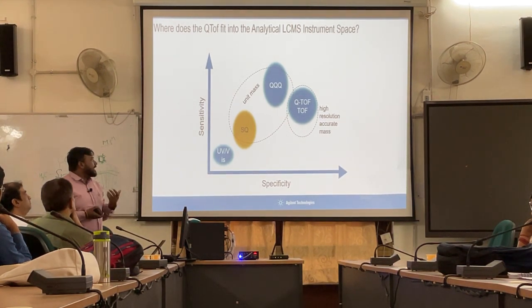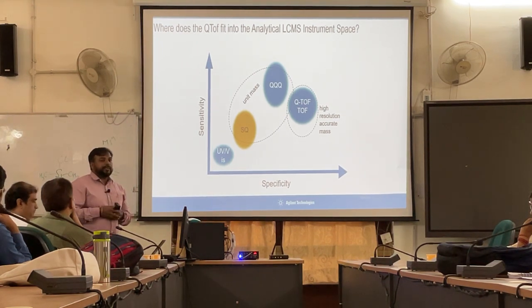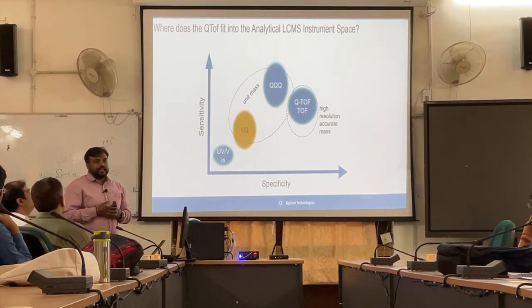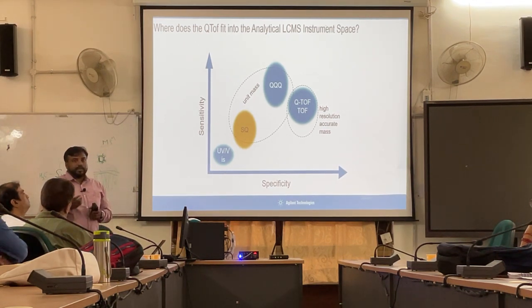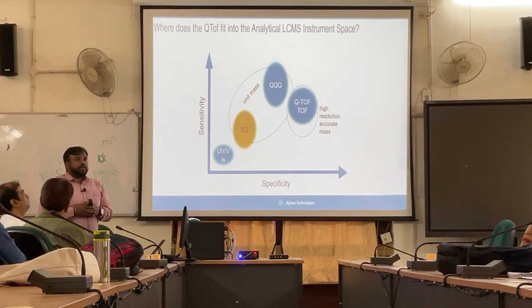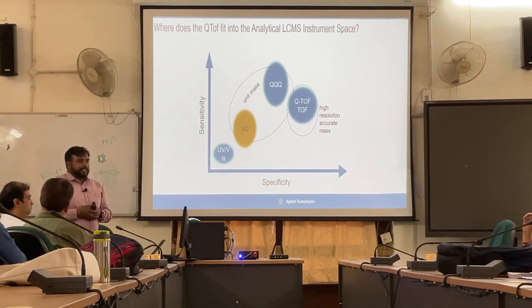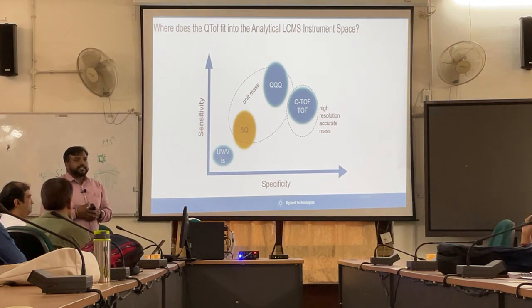So what is it that we were not able to do, that made us move to mass spectrometry? Once we have many compounds, a mixture in our sample, and they have a similar polarity index, they are going to elute at the same RT. In that case, we are not able to resolve the molecules or know the molecule. To know molecules having similar polarity, we need mass spectrometry as a detector, because here mass is going to identify the molecule on the basis of their mass by charge.